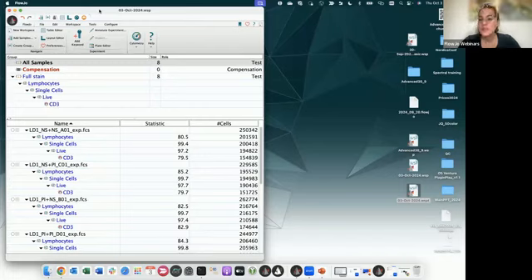But in order to use these kinds of tools, you need to create a single FCS file from whatever you want to compare, right? So if we want to compare multiple samples from multiple treatments, we will need to get a single FCS file out of this. And this is needed and stems from the nature of the algorithm itself, because these algorithms are stochastic.